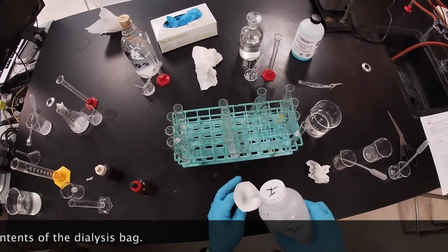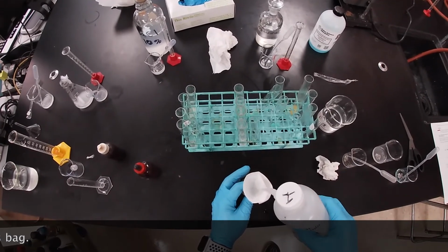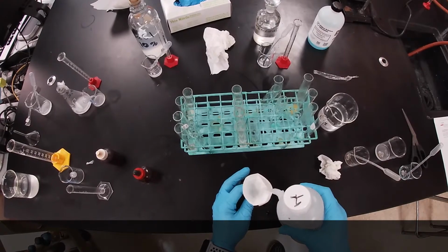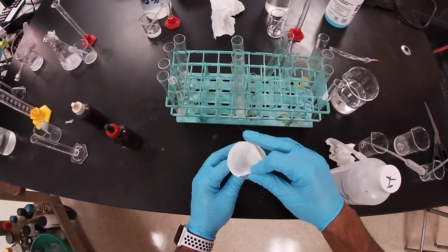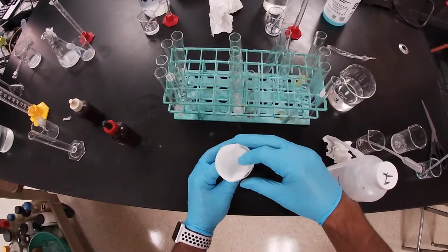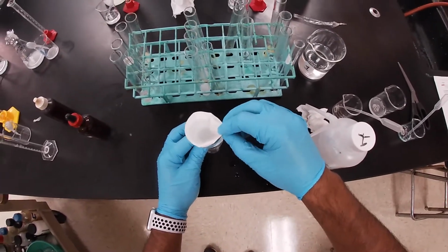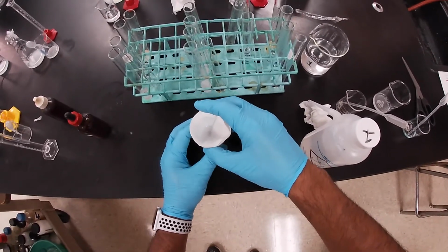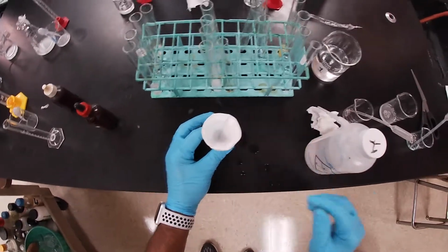We're going to add a little bit of water so that we can adhere a little bit of the funnel. Perfect.